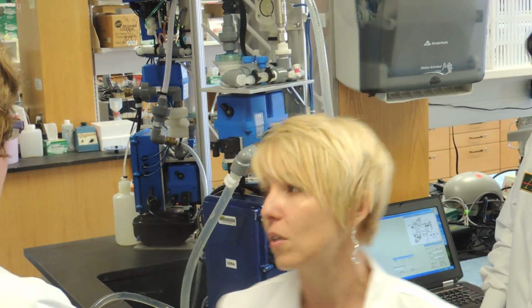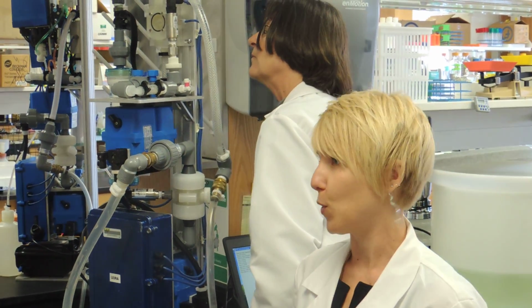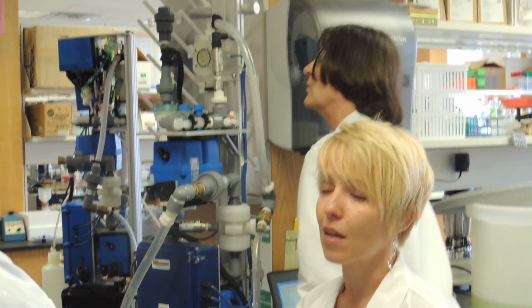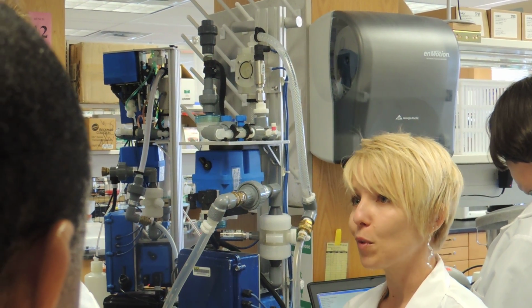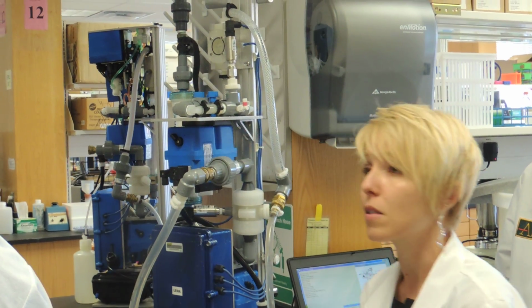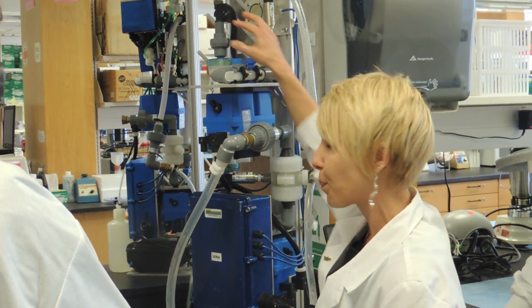And basically this filter is a hollow fiber filter, which means it's a bundle of straws, if you will, that have all been packaged together in this epoxy matrix. And anything that is under 30,000 Daltons is going to pass through that filter, but pretty much any microorganism, a virus, bacteria, protozoa, as well as some larger proteins will be trapped simultaneously within this one filter.